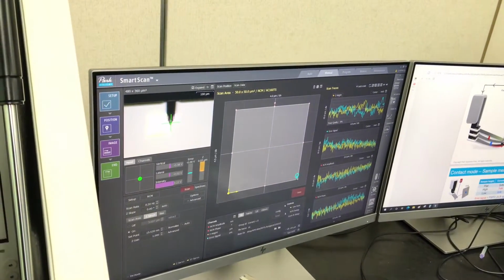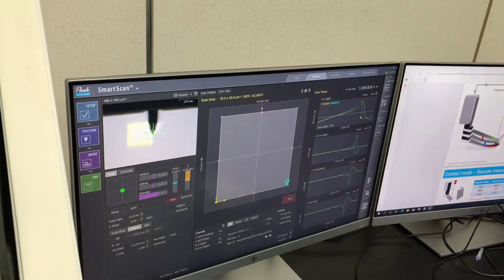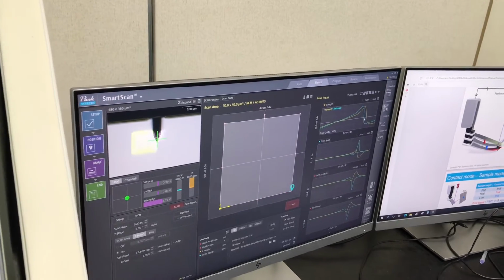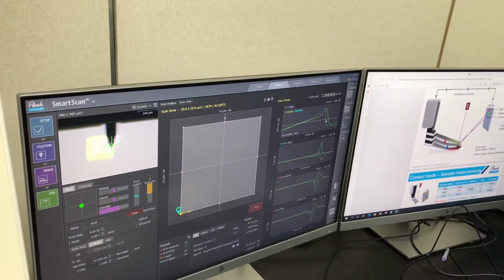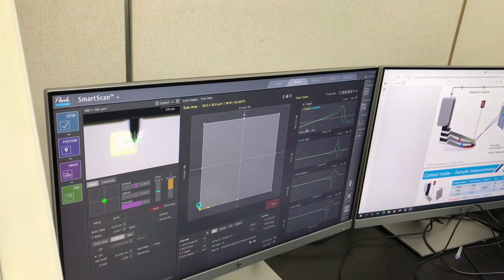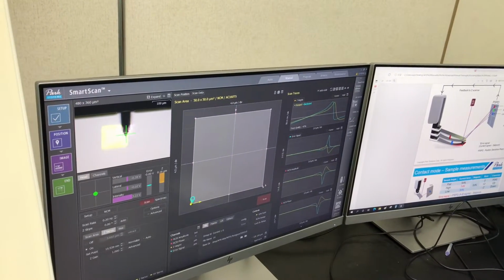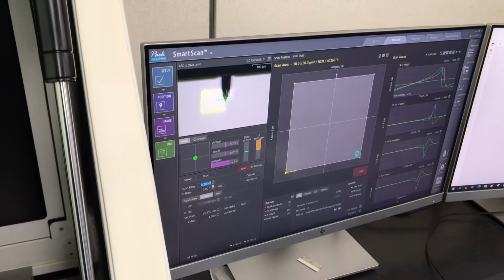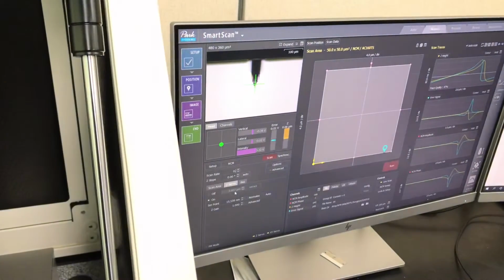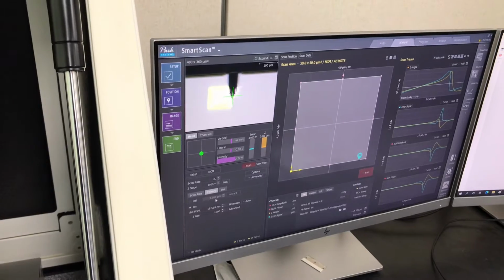After you focus on the approach mode, you can get some signal on the right side. So the backward signal will be the same as I told you about that. If you can control the mode at very high resolution, you can change the scan rate and the set point also changes. But some samples need very optimized scan rate.